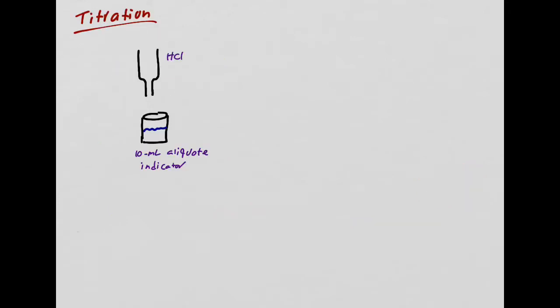Now that we've talked about the concept, I want to go back to the experiment. So we said at the beginning, we're going to do a titration. And what a titration is going to do, if you remember, is give us the K equilibrium, which in this case is KSP.